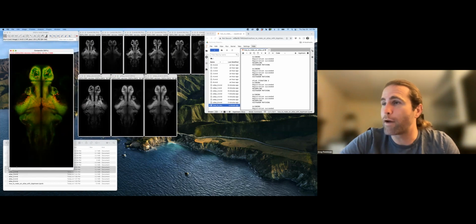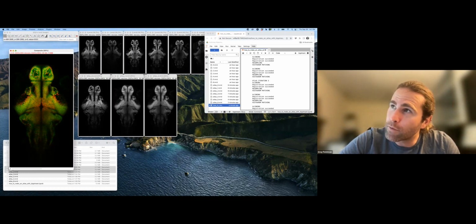So things moved around. That's pretty much what I wanted to show, is that Atlas 1, which is in green, so the boundaries of the forebrain shrunk a little bit. The boundary of the tectum neuropil and the optic tectum cell bodies was pulled in a little bit. Actually, here you can just barely see, I'm not sure if it comes through Zoom, that the hindbrain here is moved into the glia area a little bit.